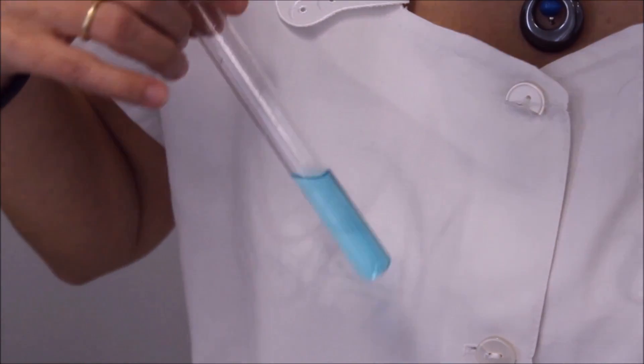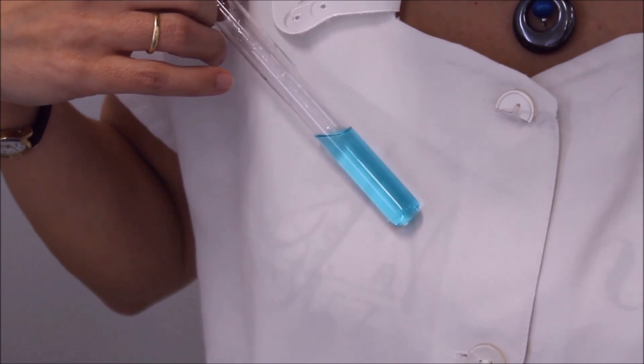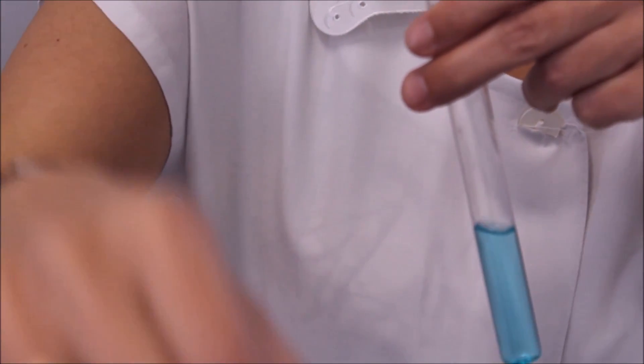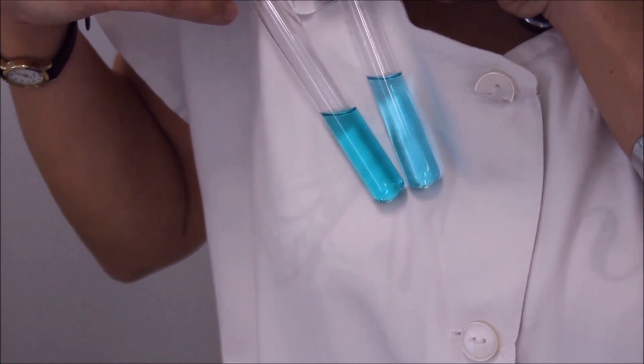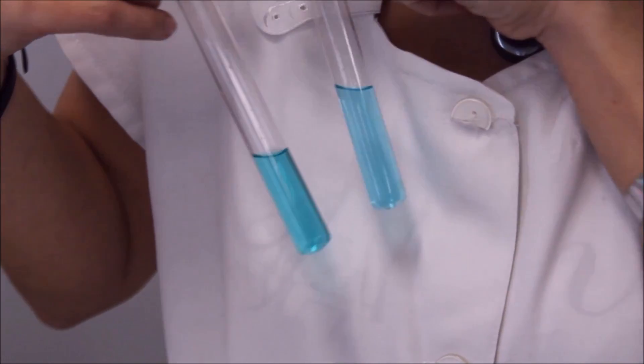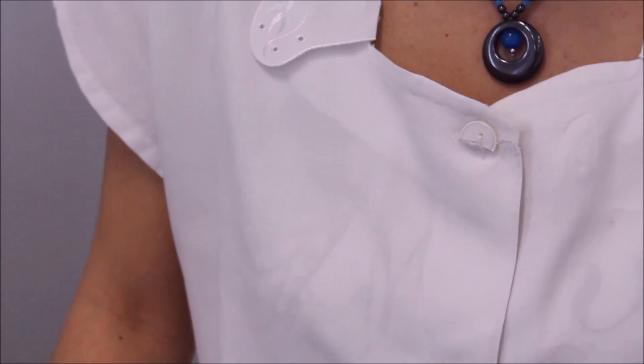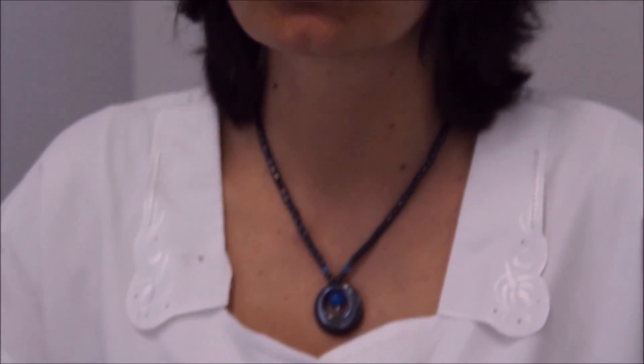A káliumszulfát oldattal megbontott egyensúlyrendszer színe már kékebb. Ennek a magyarázata a következő: a legkisebb kényszer elve értelmében, ha egy dinamikus egyensúlyban lévő rendszert megbontunk, akkor annak a folyamatnak lesz nagyobb a sebessége, amely a zavaró hatást csökkenteni igyekszik. Tehát a káliumszulfát oldat hatására egyre több kékszínű részszulfát keletkezett.